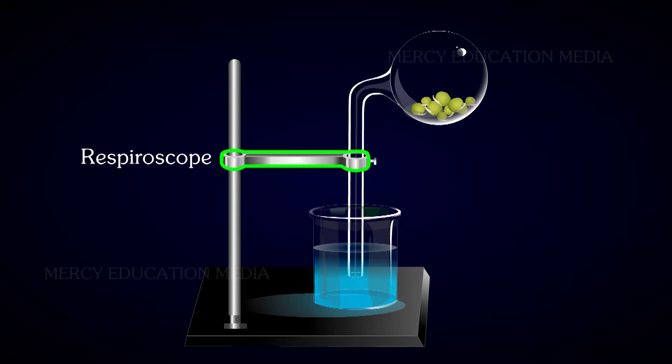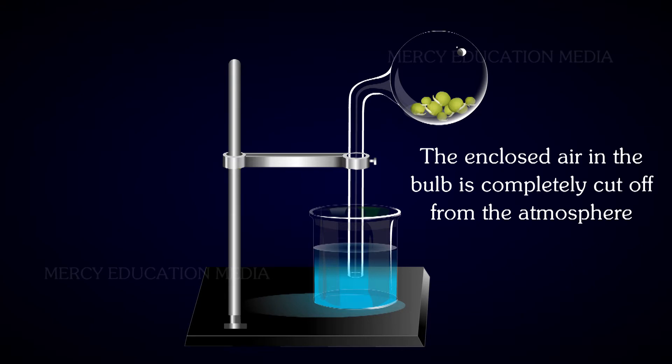The Respiroscope is fixed in the vertical position with the help of a stand. Thus, the enclosed air in the bulb is completely cut off from the atmosphere.